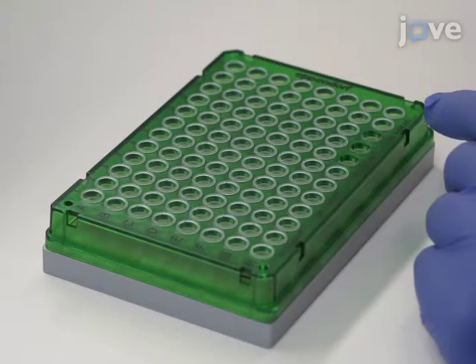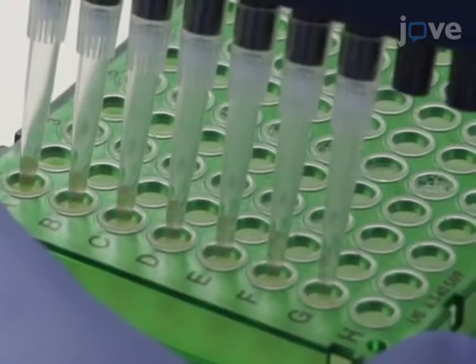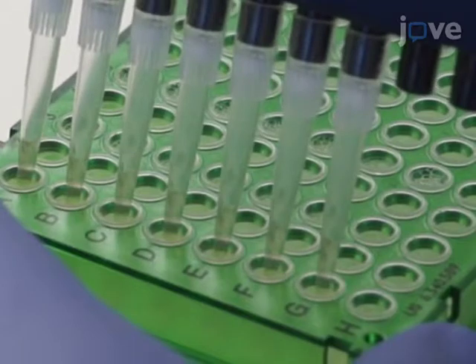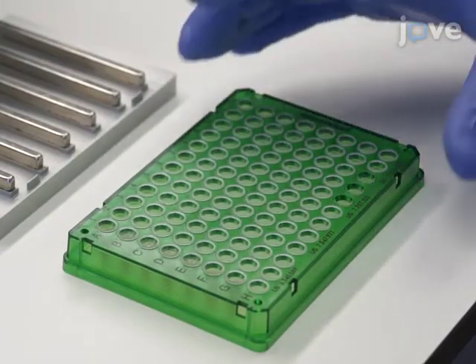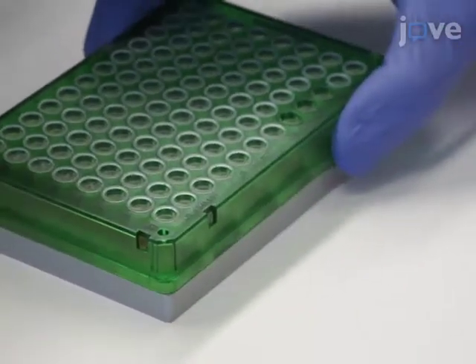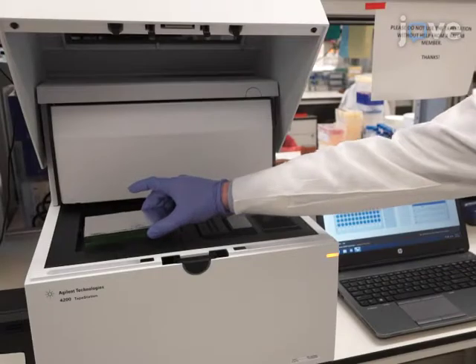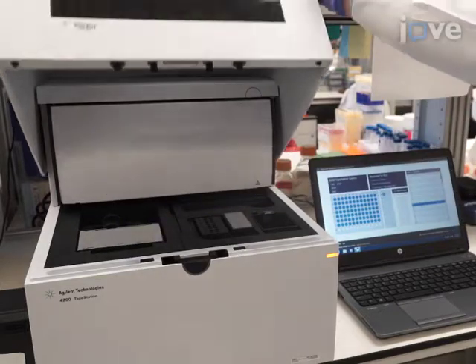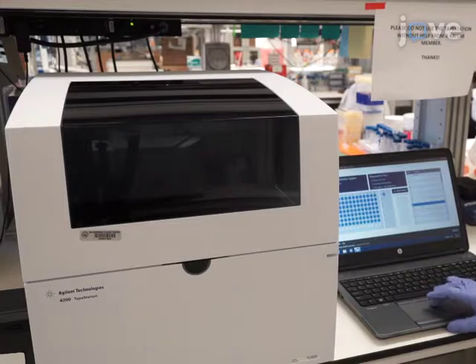After allowing the beads to dry, remove the samples from the magnet and add 25 microliters of 10 mmol Tris-Cl pH 8.0, mix by pipetting 25 times, and incubate at room temperature off the magnet for 4 minutes. After incubating at room temperature, place the samples back on the magnet and incubate at room temperature for 4 minutes. Now, quantify the libraries using a high-sensitivity DNA electropherogram instrument before multiplexing to ensure the sizes are suitable for sequencing.